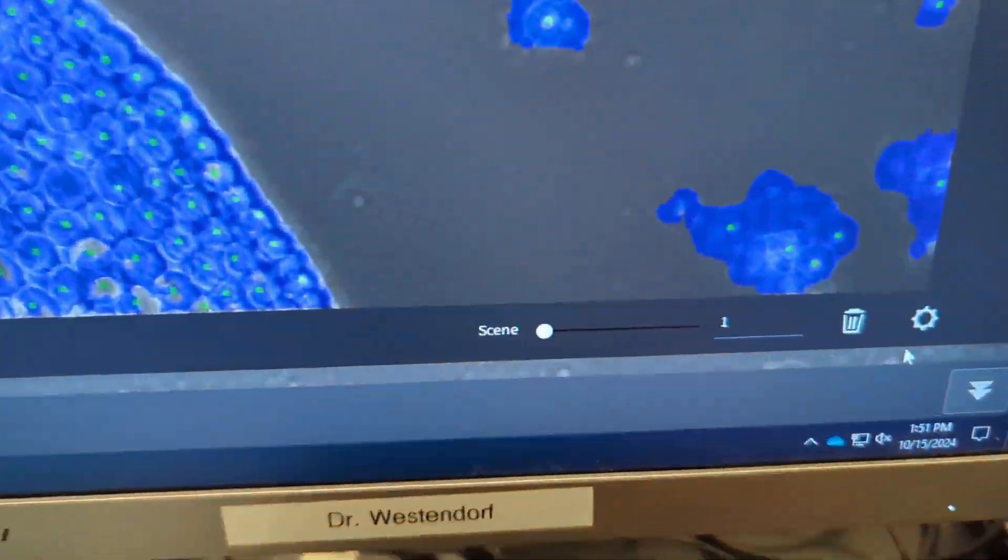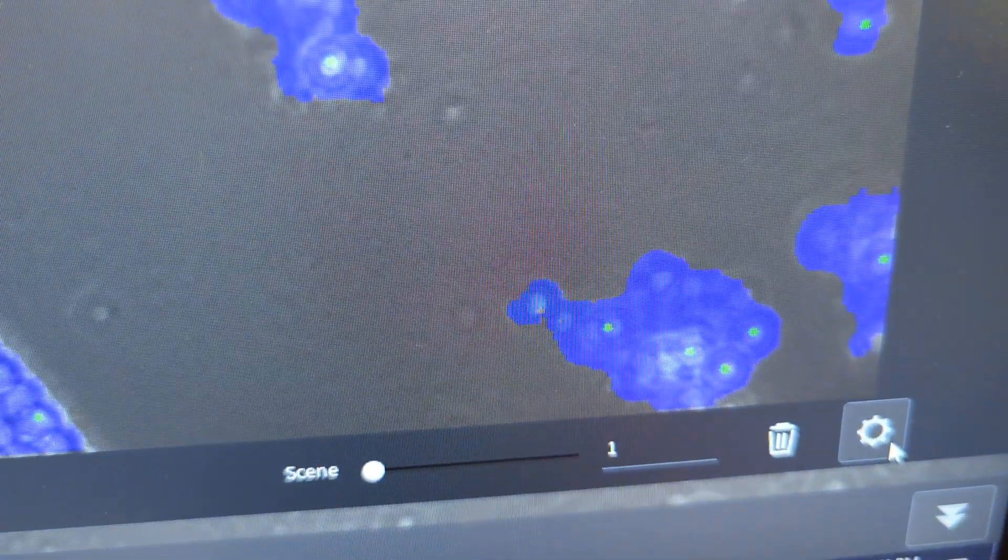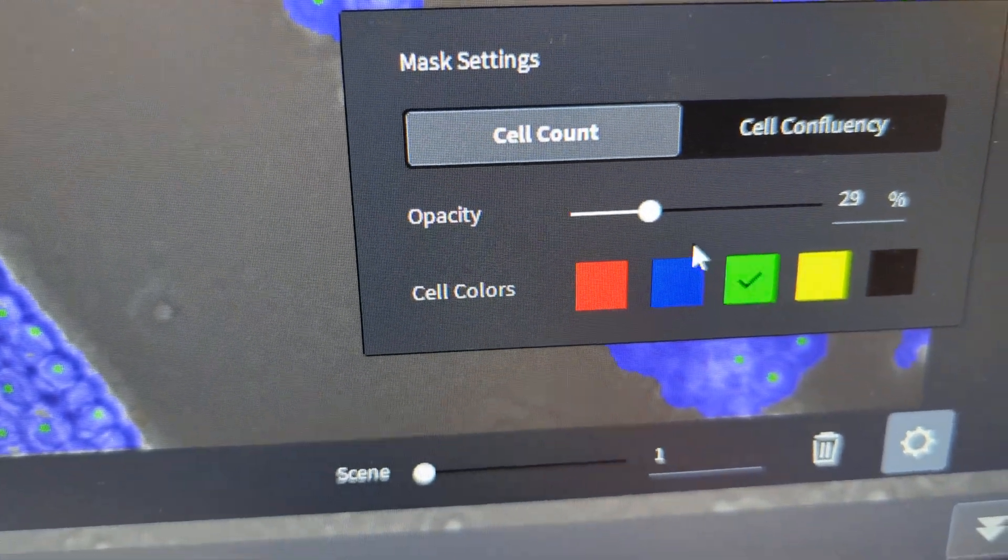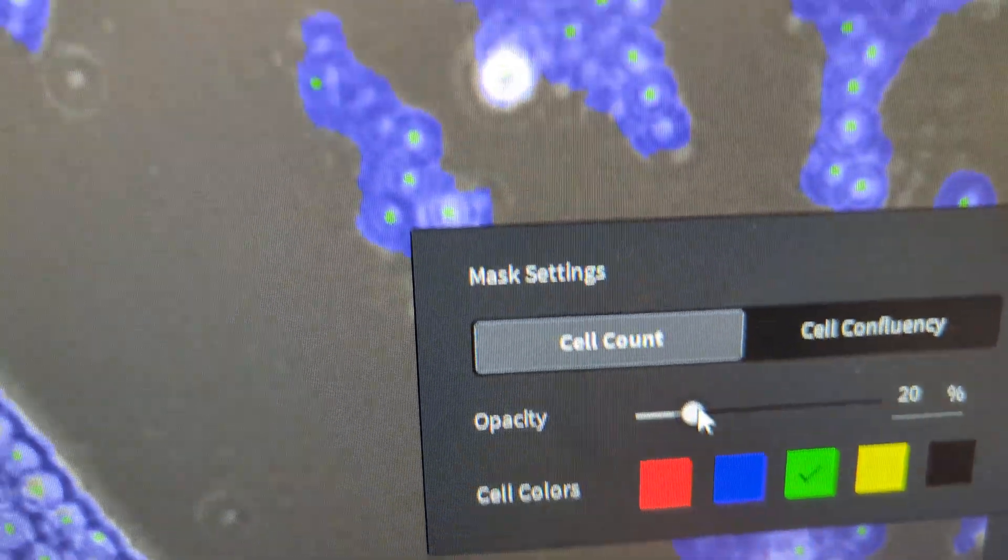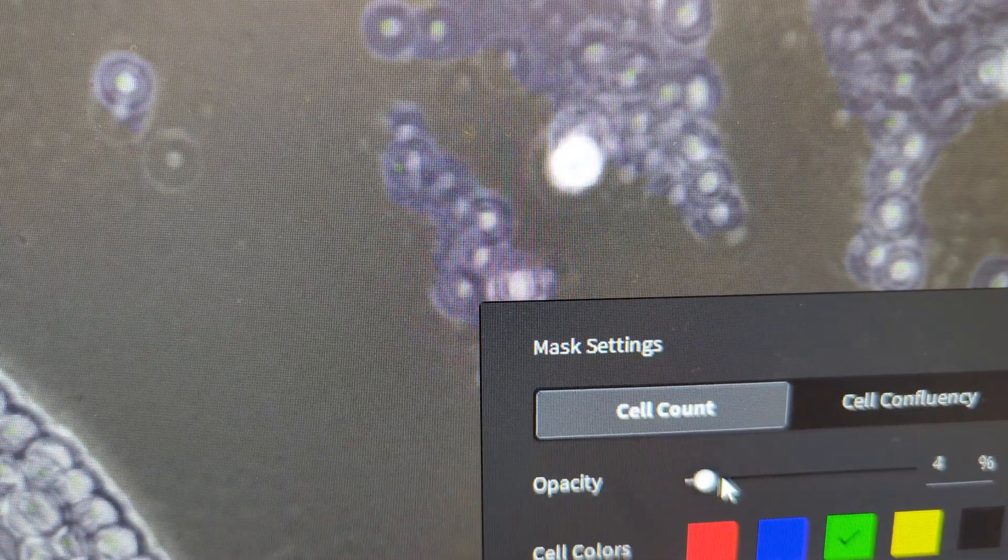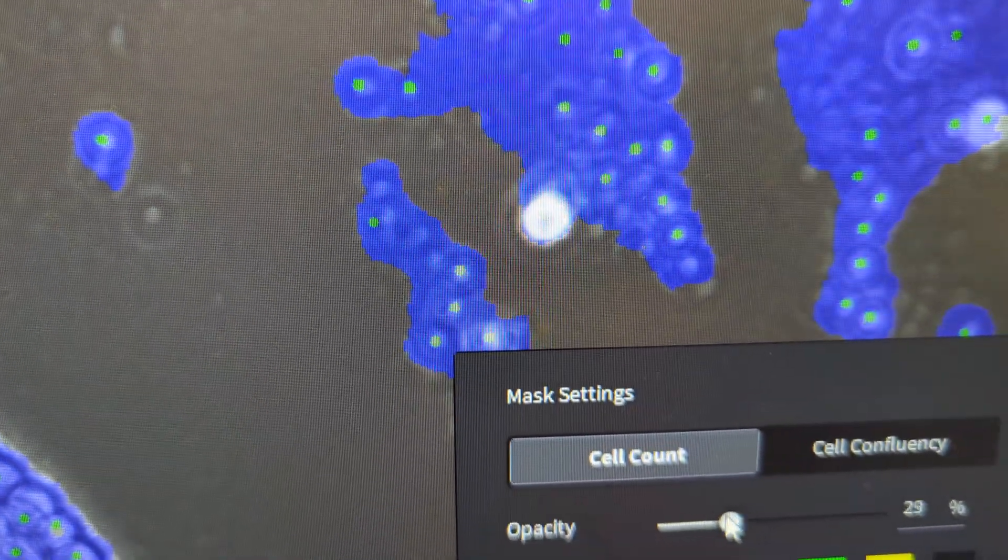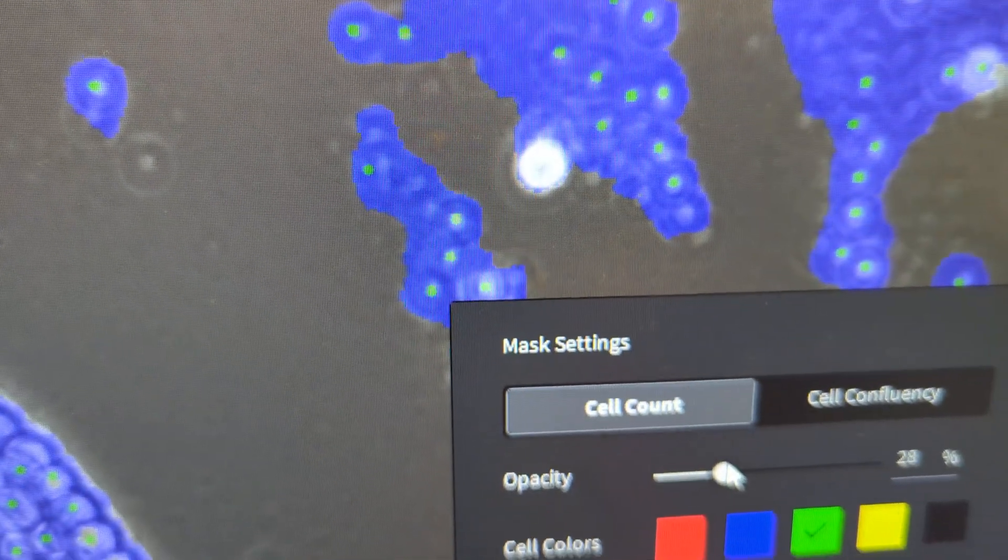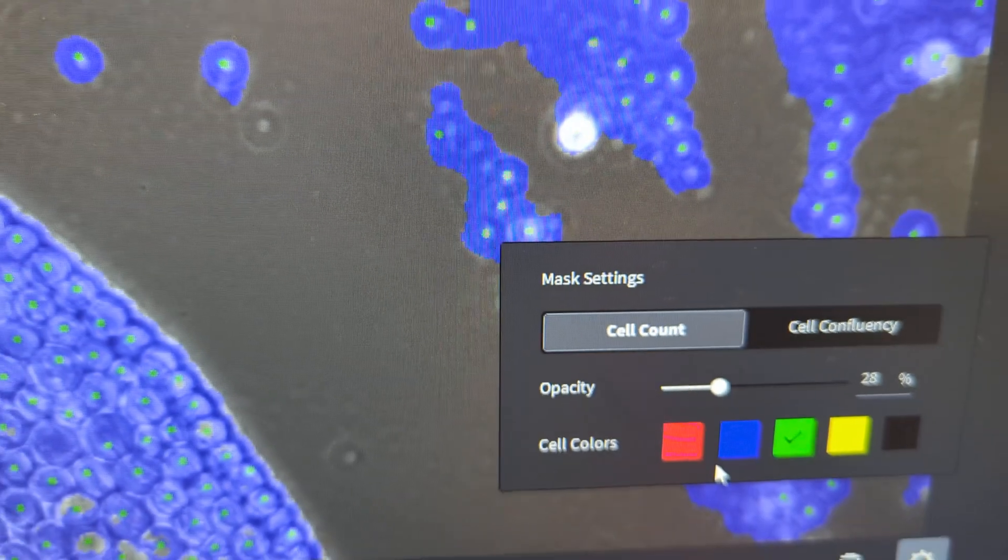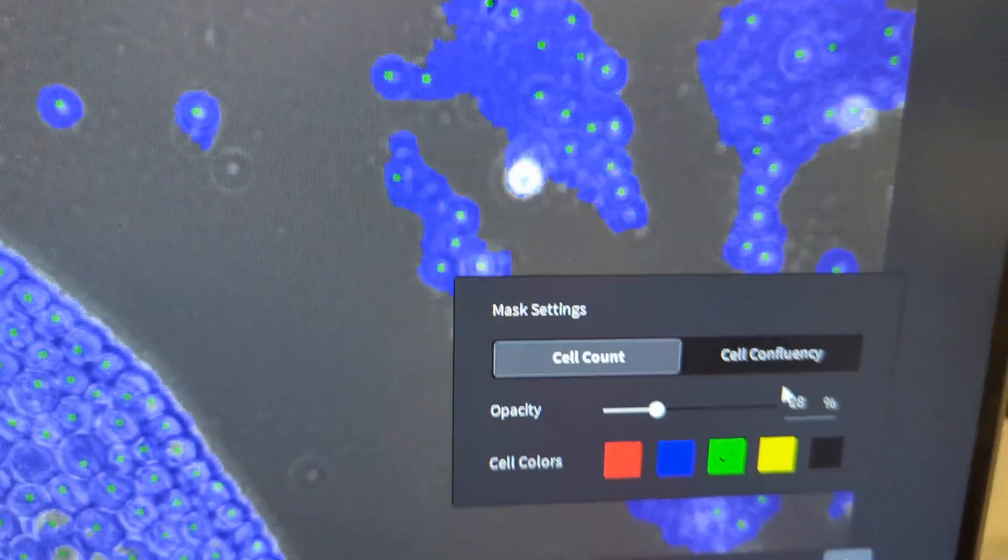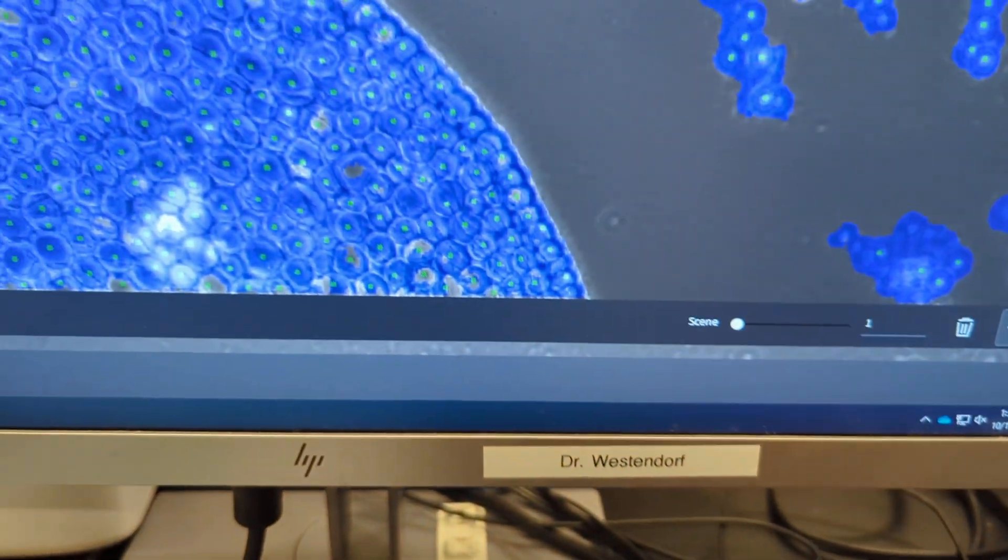Okay, there's an icon down here in the corner with a gear, and that gives you your opacity of those. You can see I'm adjusting them clearer or more, and somewhere around 30% is usually about right for those. And you can change the colors of either cell counts or confluency, however you want.